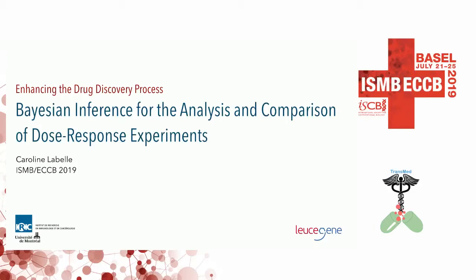Enhancing the drug discovery process: Bayesian inference for the analysis and comparison of dose-response experiments.